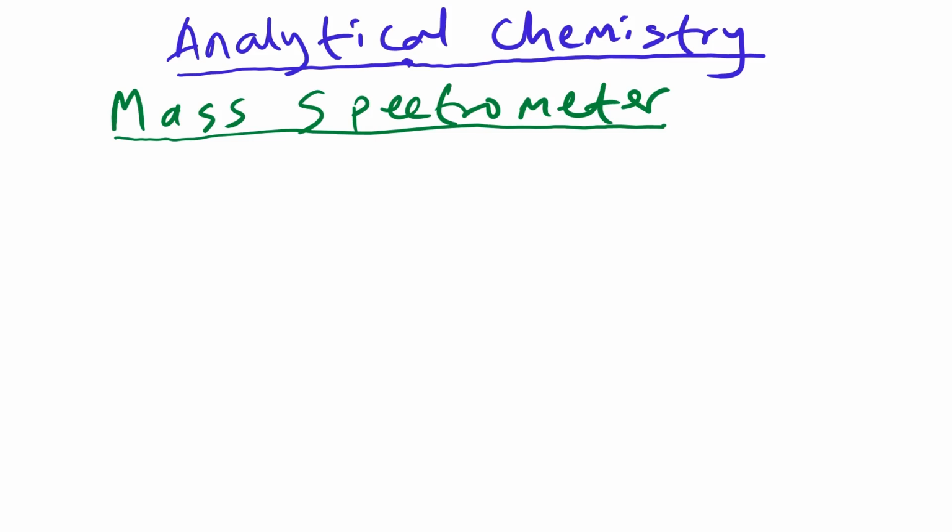Previously, we had discussed how to identify fragments that make up peaks in a mass spectrum, and that is basically A-level curriculum. So today we are going to look at how to analyze a mass spectrum itself and identify the compound that it belongs to, and it's more advanced than A level. It is for undergraduate and postgraduate level.